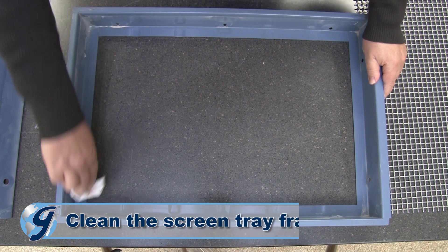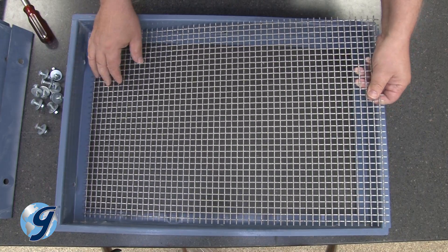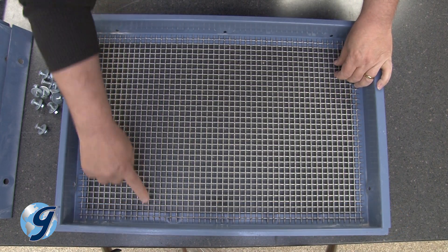Now clean the screen tray frame before installing a new wire cloth. Now carefully place the new wire cloth into the screen tray. Be sure the wire cloth is centered within the screen tray.